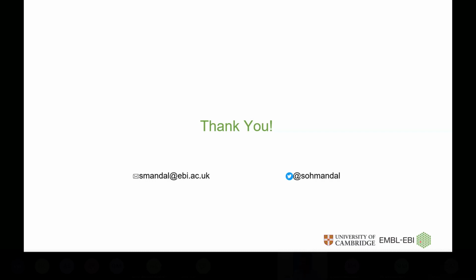Yes, indeed. Okay, so I have a couple of questions, and perhaps there will be others in the meantime. I really enjoyed that, and very much enjoyed it when you first introduced this. It's a great improvement on the StarDist, which is already pretty cool. I'm wondering about 3D segmentation and what the challenges are there. Have you tried already to deploy this on 3D data sets, and what kind of problems and challenges have you found there if you've tried it already?